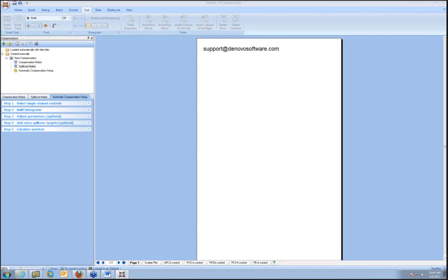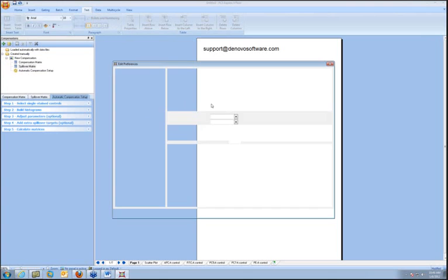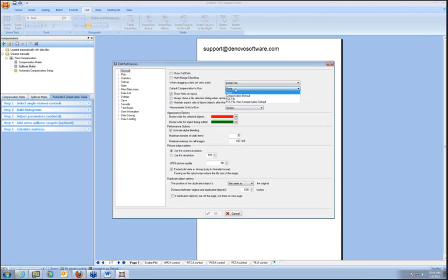We just got a question: do you need to turn off compensation from Diva before applying ours? Absolutely not. You can turn off the preferences like I showed and not import that compensation. So if you turn this to none, it won't import the compensation that's in the Diva file, even though it is actually in the Diva file. But even if you have imported that, you can change that compensation with the sliders. So if that file is loaded and you have the compensation from the Diva software and you don't like it, you can just right-click on the plot and adjust that exact compensation with sliders, or you could copy and paste that compensation, apply the pasted version to your plots, and adjust the pasted version, leaving the original one alone. You can do whatever you want.